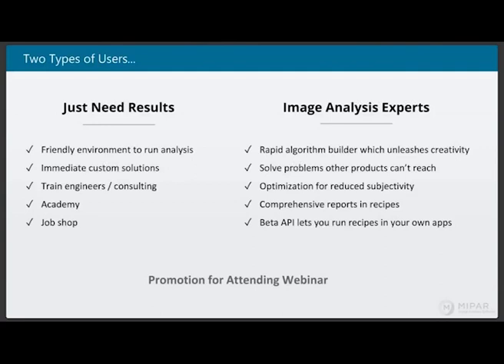Pavel, was there anything else you wanted to address? Not that I see. I'm still looking through this list of questions, and I think we covered most.